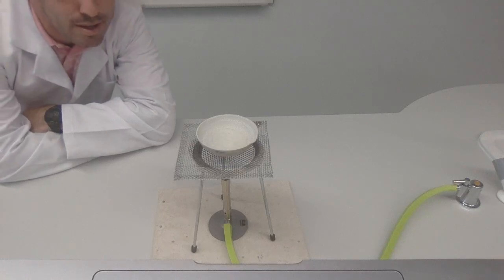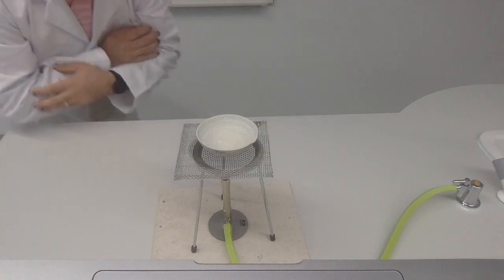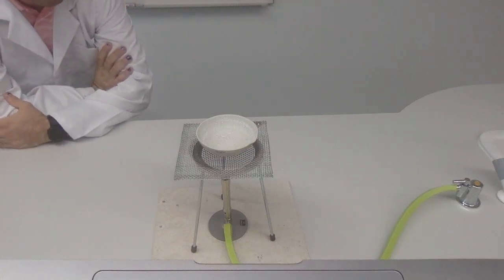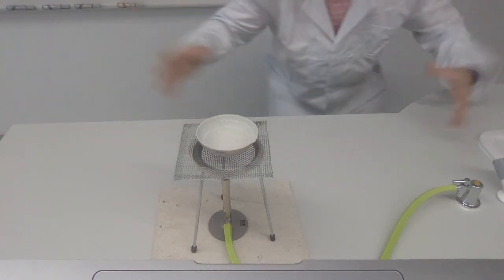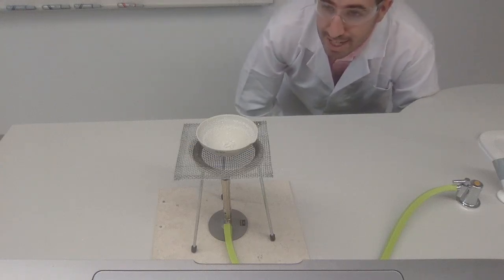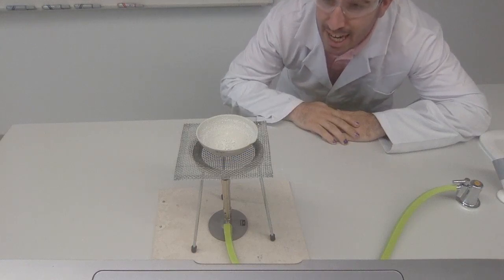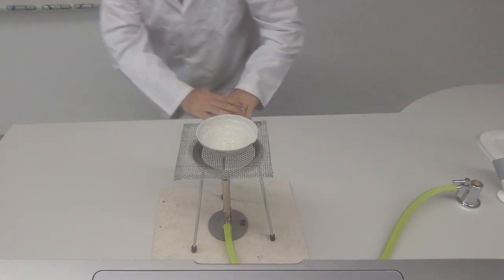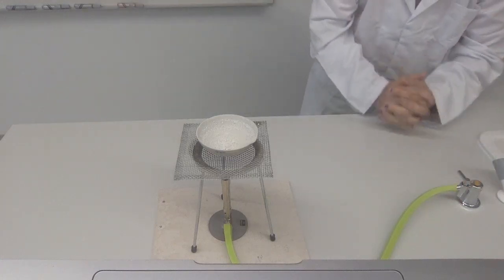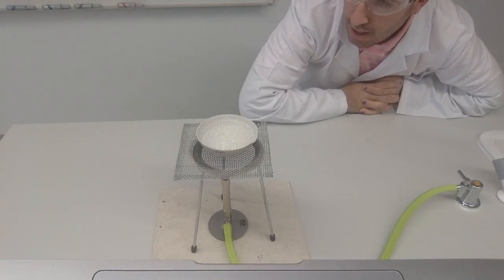And here we go. We're getting up to the finale of our crystals. You might see a lot of bubbles, a lot of popping happening. Oh my goodness, that is so amazing, isn't it? Pop, pop, pop. Oh, look at that go! My gosh, that's amazing. Oh, there it goes. Can you feel the intensity of it? It is fantastic. And there we go. Look at that. How wonderful is it? So let's turn off the heat before it gets too hot. And there we go. We've got our sample left over.